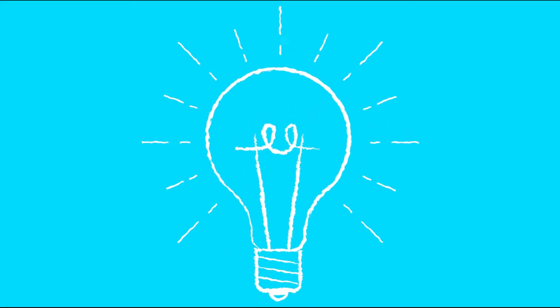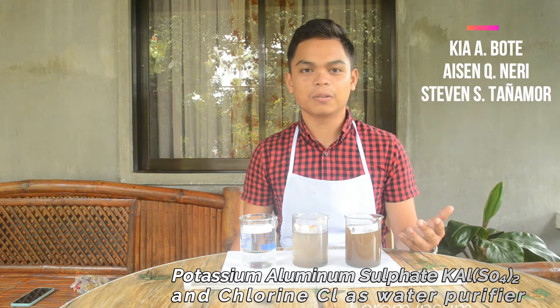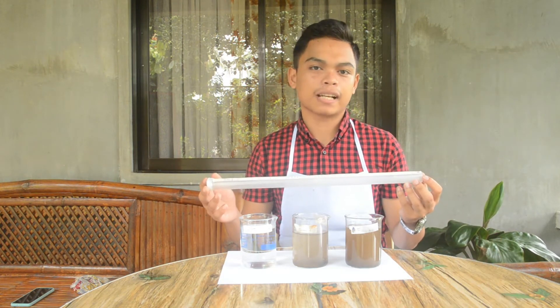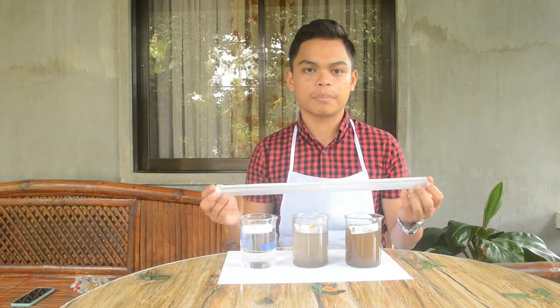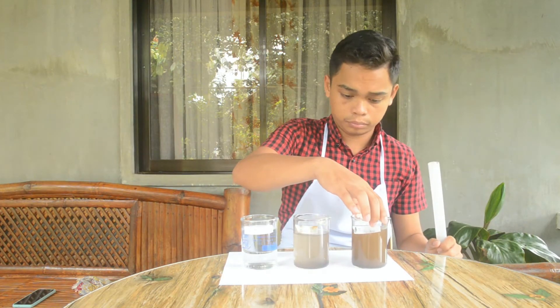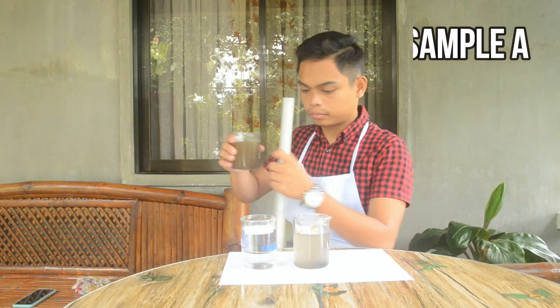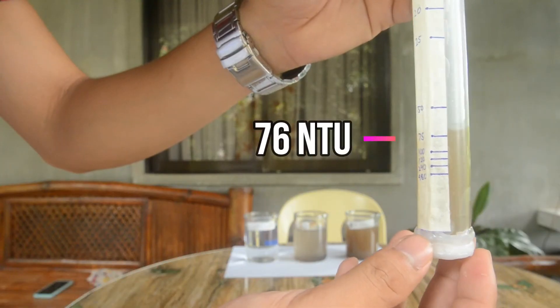Therefore, the lower the reading, it means the clearer the water. I have conducted a research together with my colleagues, and through using this DIY turbidity tube, we have successfully investigated the turbidity of a water sample from Banica River. For us to understand this deeply, let's take a look at this. Here we have three different water samples with different clarity. Let's find out the exact turbidity level of each sample.